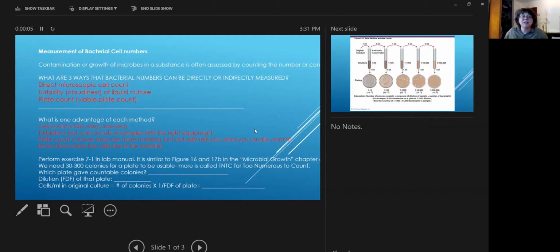All right. So I wanted to talk to you about a plate count experiment and why we do them, and most importantly, how we do the math that's required to get results from a plate count experiment.